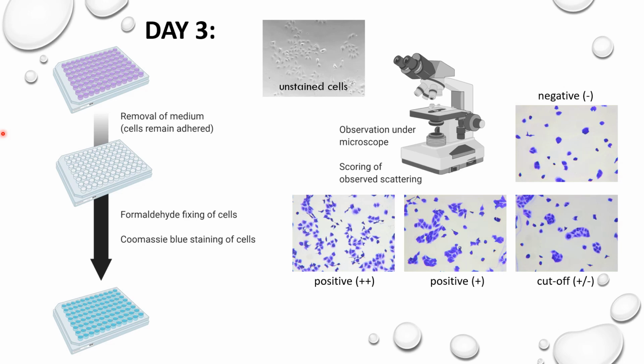We throw that into a box and decontaminate that medium in case there are any loose cells still alive. We fix the cells with this 4% formaldehyde solution in each well, and then we get rid of this formaldehyde solution and submerge the plate into the dark blue dye, the Coomassie blue stain, and leave it there for at least an hour. Also the fixing we do roughly for 1 hour.